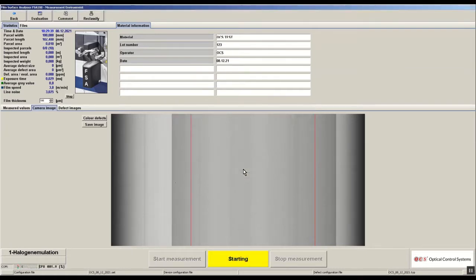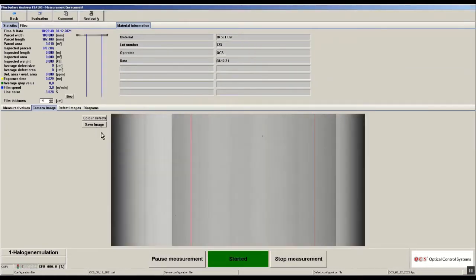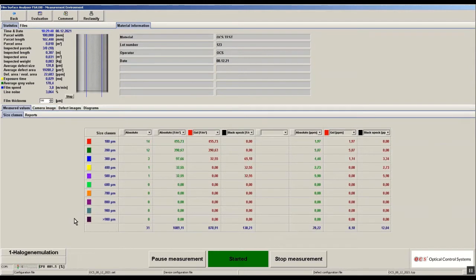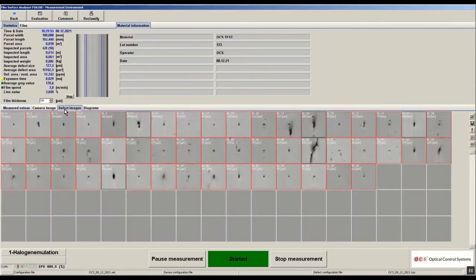The main table will give you information about the measured values. We see here the different types of defects like gels and black specks and we see the different size classes. The size classes as well as the defect types are freely definable.